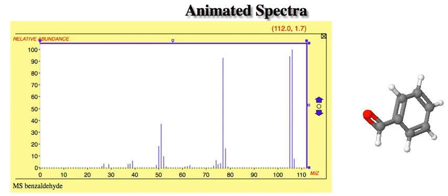So the upshot summary of this is certain atoms are pretty easy to spot in a mass spec. Bromine with the 1-to-1 mass ratio and subtracting off the 79 or 81, getting a strong peak, that's pretty indicative.